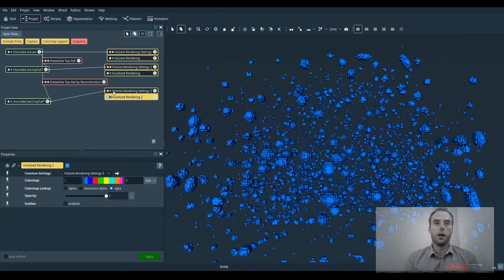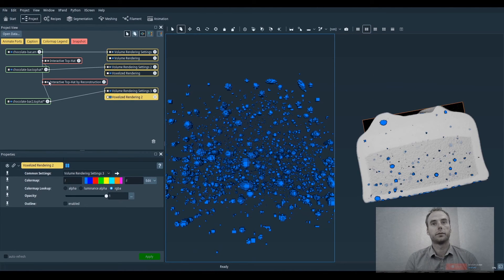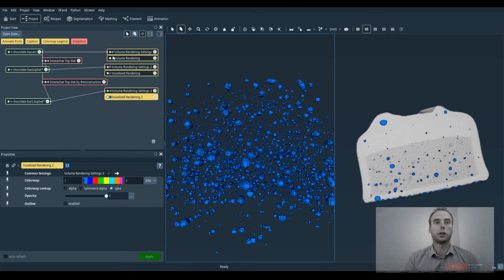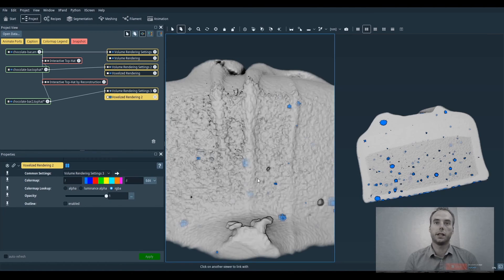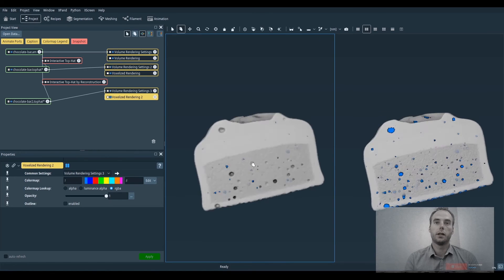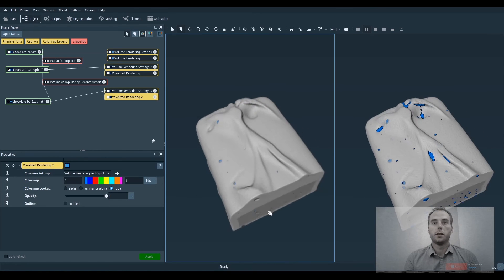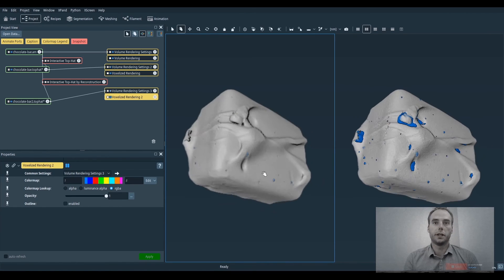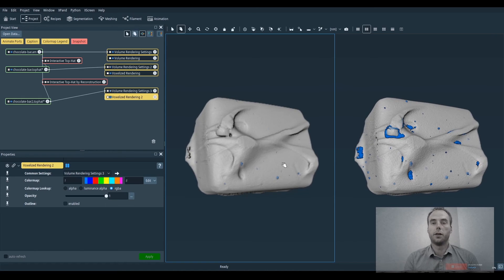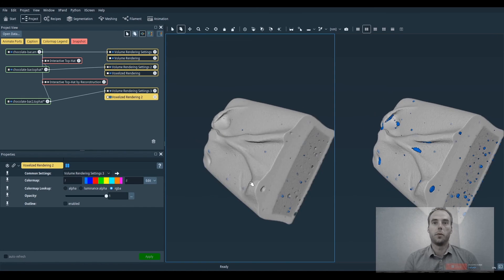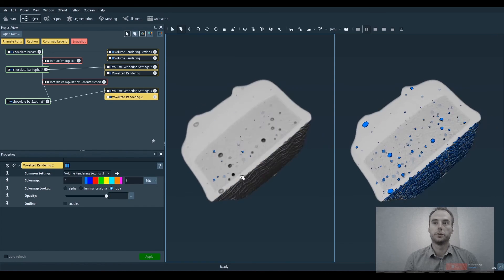And now we can compare both results. And we can actually see that this time the internal porosity segmented do really correspond to internal porosity only and not to open cavities also.